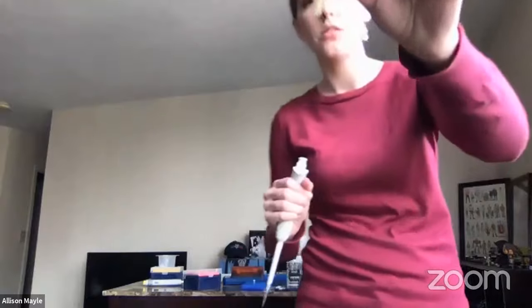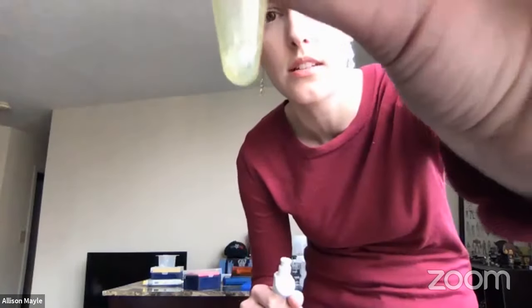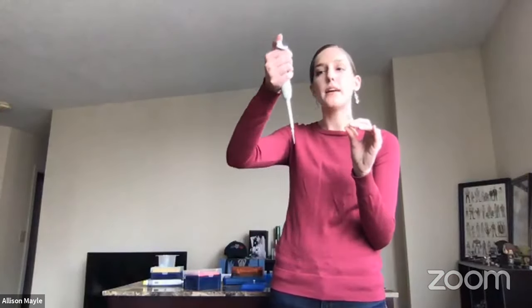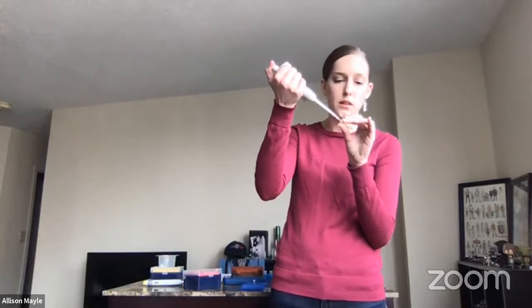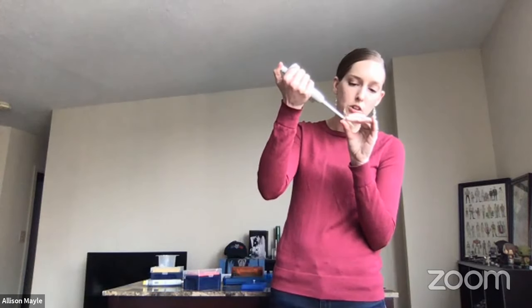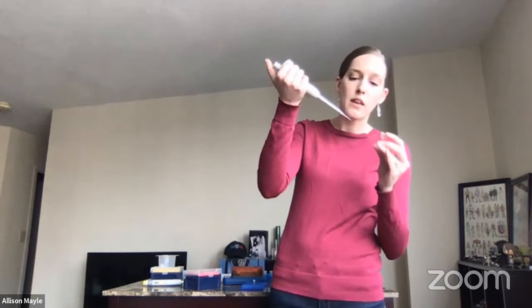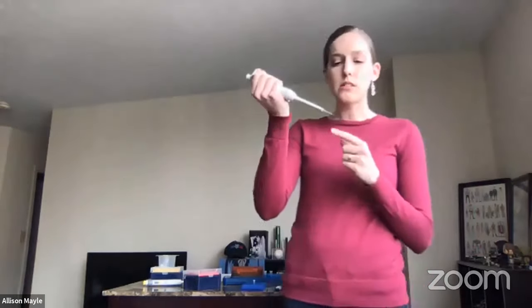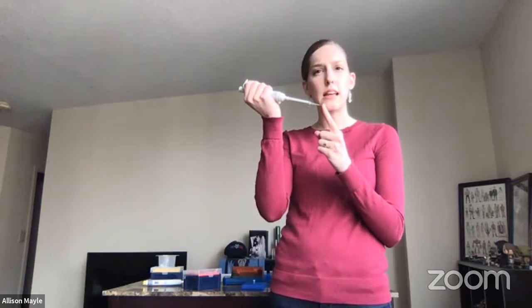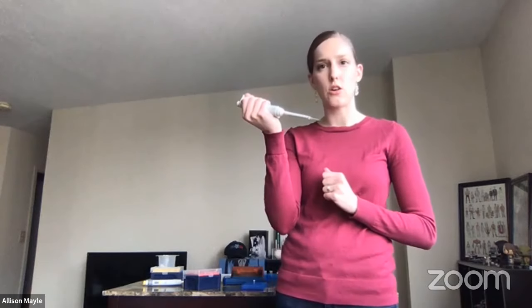There's still a little disc inside of my tube with the liquid — I don't need to remove that disc. I'm going to use my pipette, press down to the first step, and try not to stab right onto the disc. I'll put my pipette in the liquid and release my thumb. My only concern with stabbing onto the disc is I might not draw up the right amount of liquid if the disc is preventing liquid from entering the pipette tip.